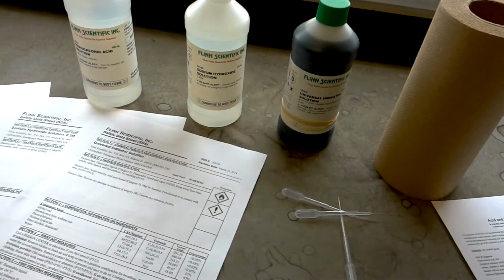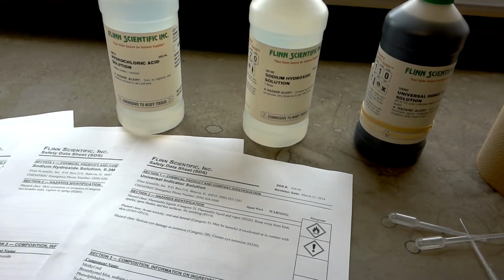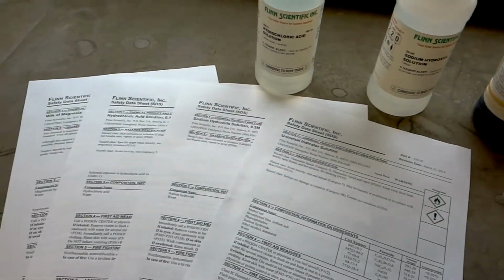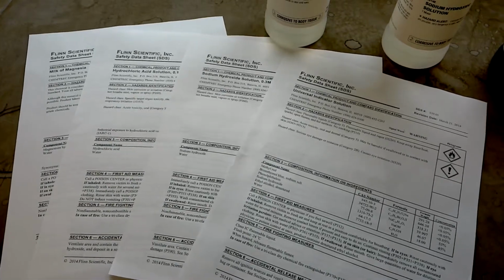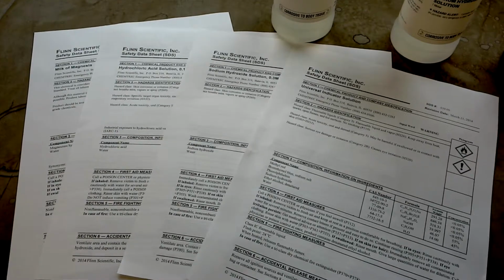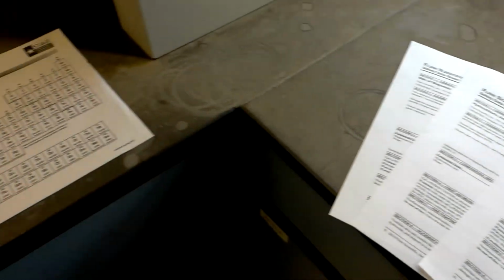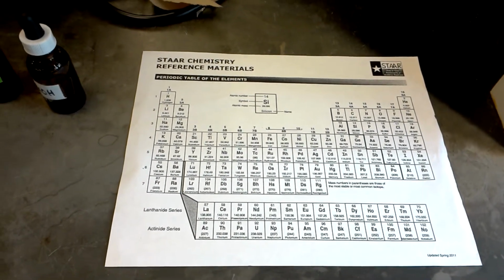Paper towels and pipettes. Be sure that your hydrochloric acid and sodium hydroxide are both 1 molar concentrations and that you've chosen the universal indicator solution that has a pH range of 4 to 10. Thoroughly review your safety data sheets to ensure that you're familiar with all of the precautions that you need to take using these chemicals, including that universal solution is very flammable, so you want to not have any flame sources in your lab. Your post-lab questions may need you to have your periodic table readily available.